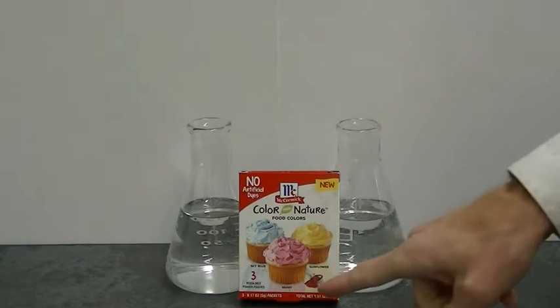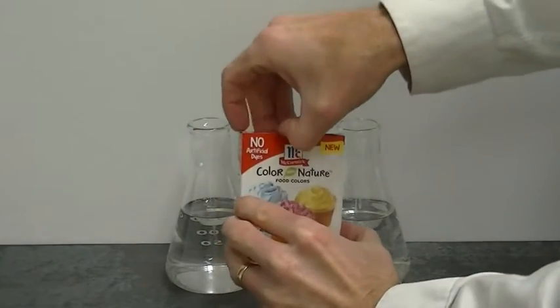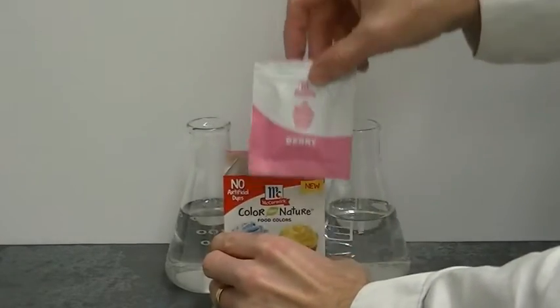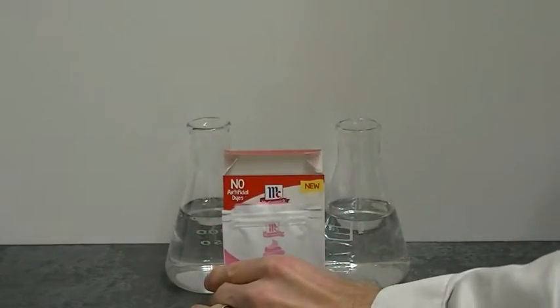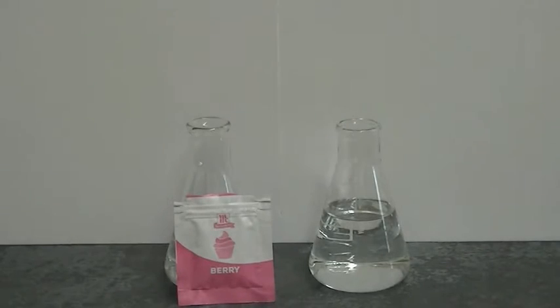Let's do some experiments with the berry dye found in Color Nature food colors. The ingredients list for the berry dye states that it contains beet juice color, and beet juice color contains a lot of the molecule betanin.